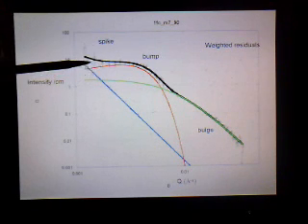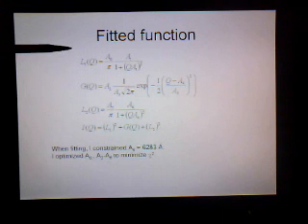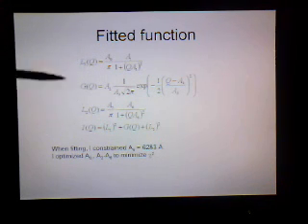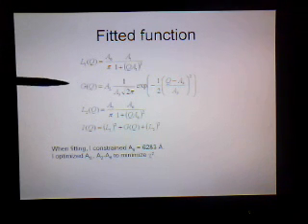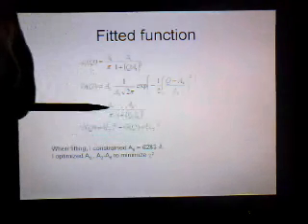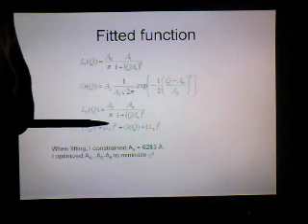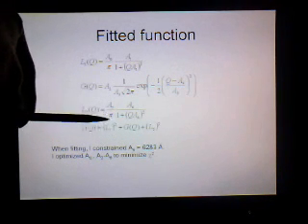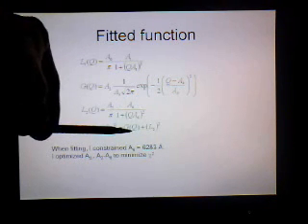In any case, onwards, I fitted the data to a collection of functions: two Lorentzians, given here, and a Gaussian function. Actually, the intensity is the sum of the square of the Lorentzian, which is consistent with Julie's paper that indicates that the static scattering, as opposed to dynamic scattering, goes as the square of the Lorentzian.